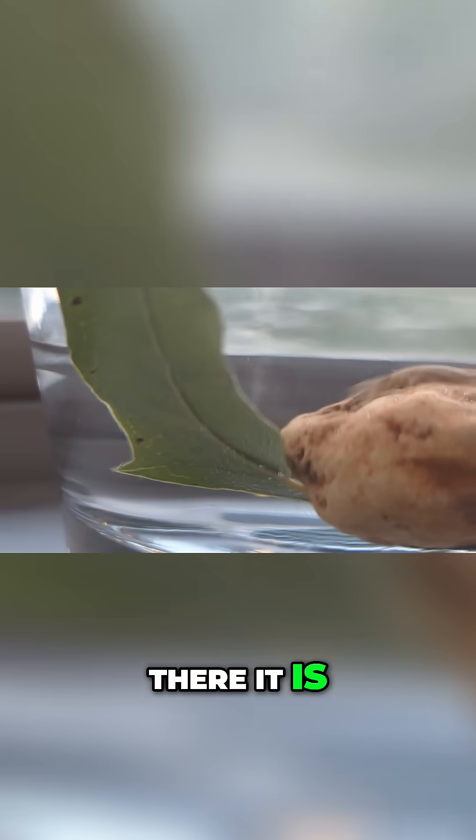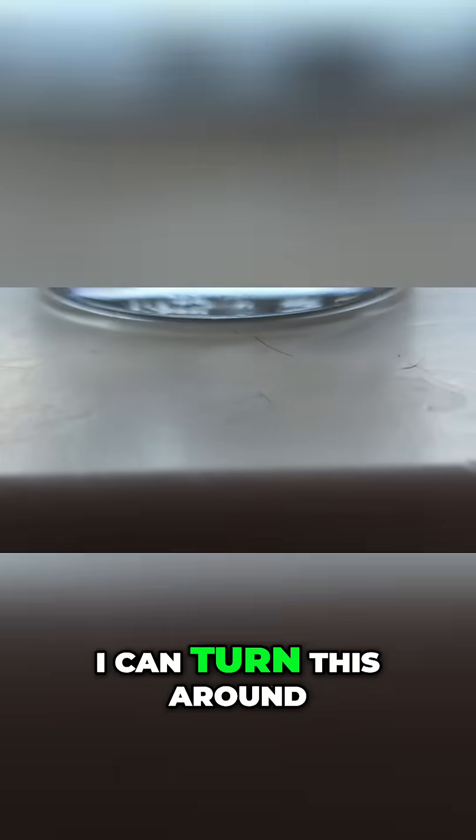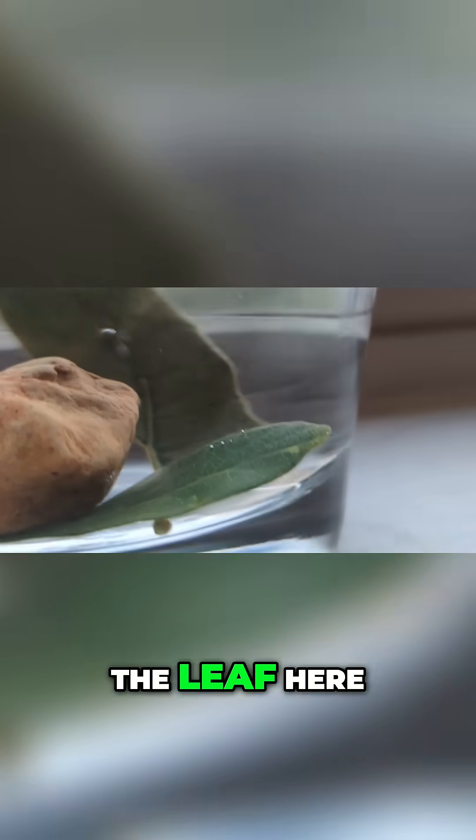We can see it — there it is. Let me see if I can turn this around, see if we can see anything else. You can see a couple more popping out on the top of the leaf here.